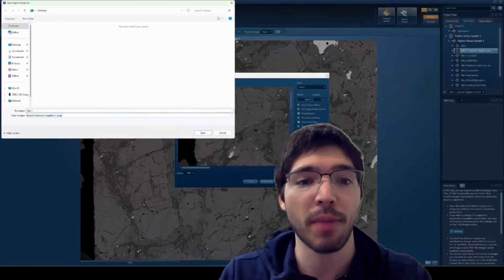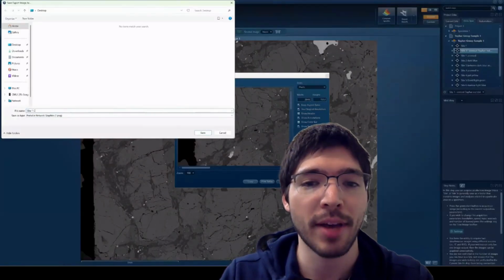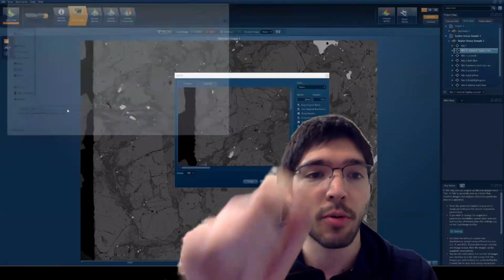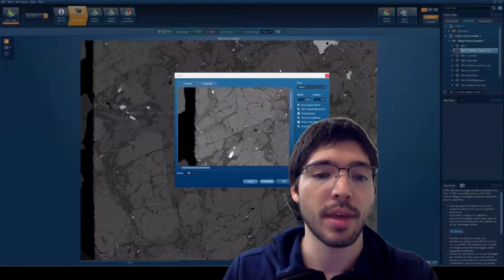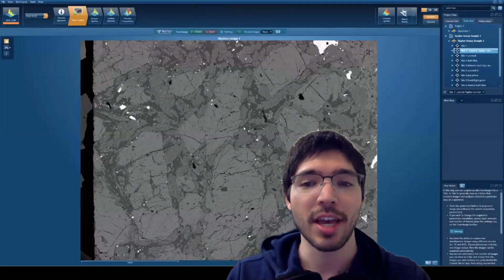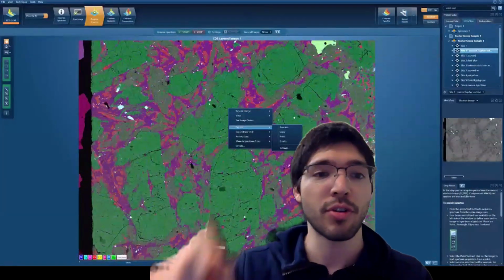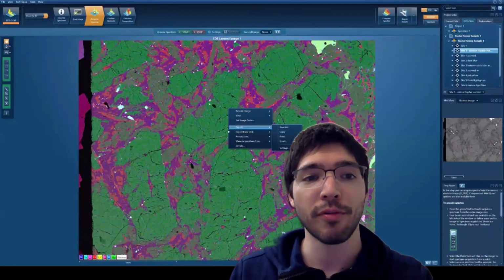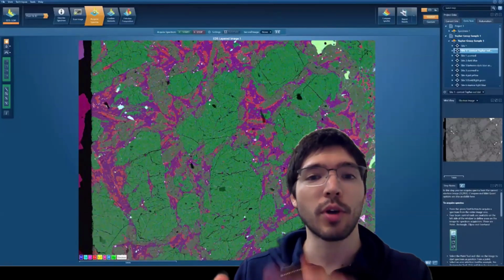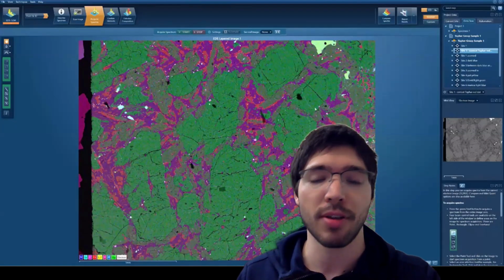Now, some spectra might be on different mineral phases, and this goes back to part one when we talked about wanting very clean areas to take these spectra from, because if you're going over different mineral phases or over cracks, you're basically picking up X-rays from everywhere in the region where you draw the rectangle. So you have to be careful that you're not getting contamination from two phases, or going over a crack and losing a bunch of data since you're not generating any X-rays there.